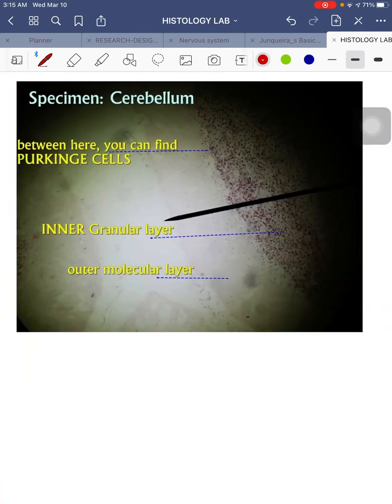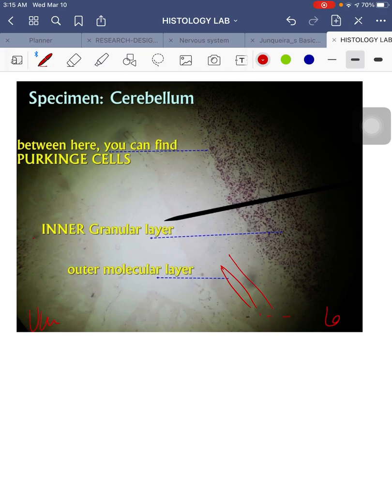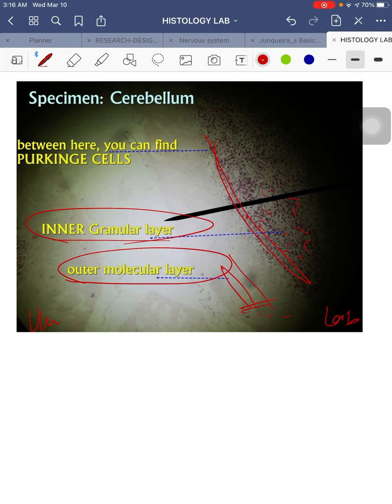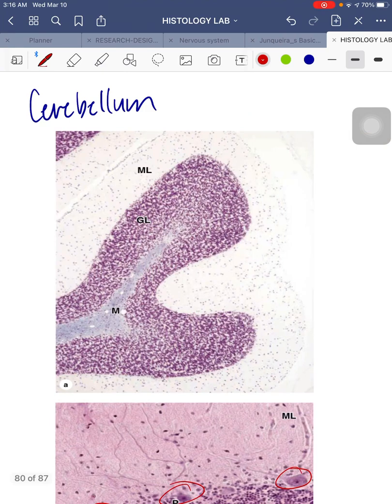Next is your cerebellum, which has three layers. The outer molecular layer is a network of nerve fibers, branches, and synapses with scattered neuronal cell bodies — it appears very uniform and smooth. The inner granular layer is densely packed with neuronal cell bodies — granular like granules, very dense in appearance unlike the smooth outer molecular layer. In between is a layer where you can appreciate Purkinje cells.